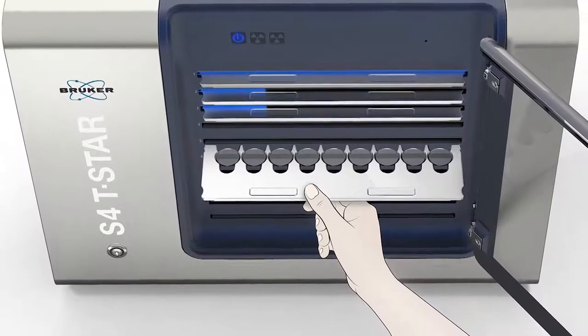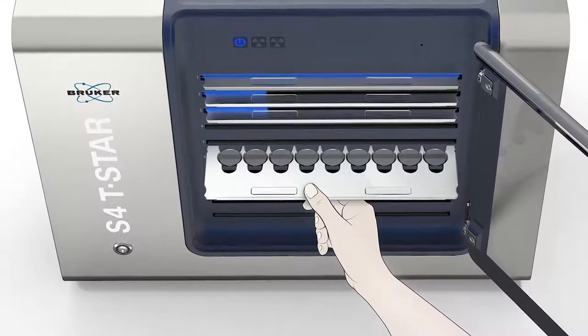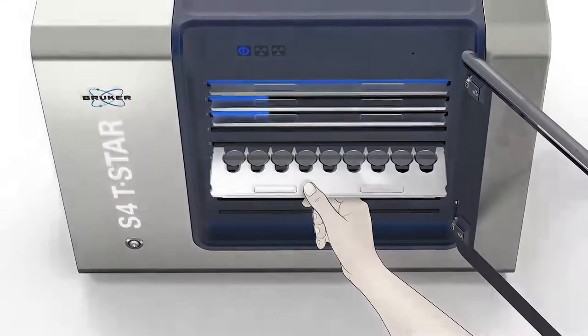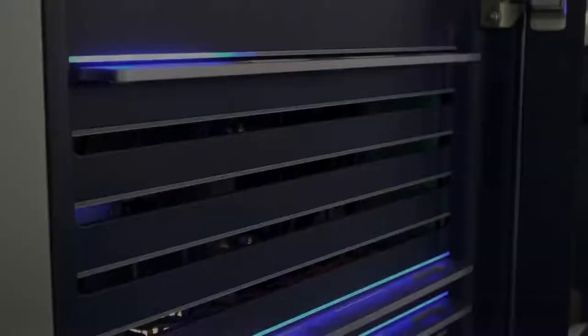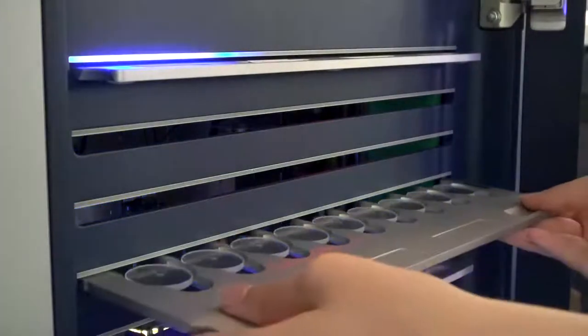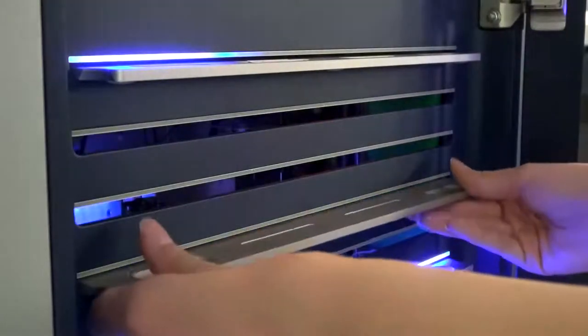The automatic sample changer is designed for multi-user operation with a total capacity of up to 10 sample trays, each holding up to nine samples.